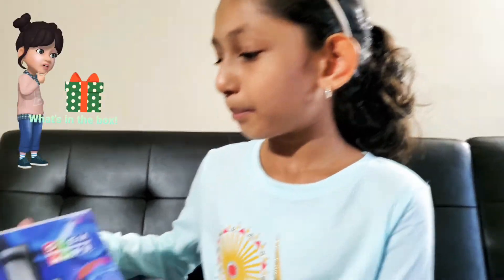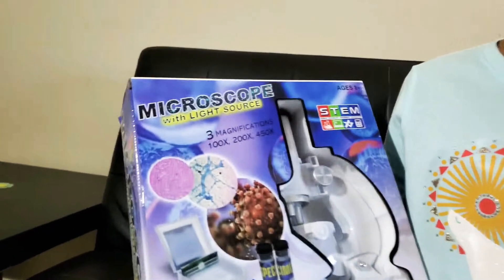Hello guys, I'm Carisha and welcome to Carisha's Unicorn. Today we're going to unbox a Microscope with Light Source.